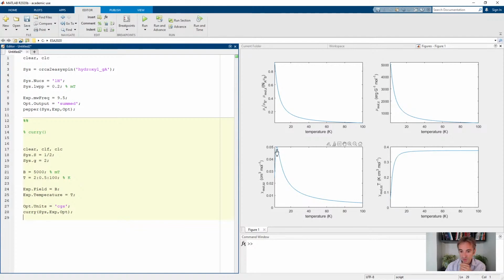And some of these numerical values are a little more amenable to use. If you go back to the SI system, you see, while for the CGS system, these are on the order of 0 to 1. In the SI system, they are 10 to the negative 6. So that is one reason why CGS units are used quite a bit in magnetochemistry.